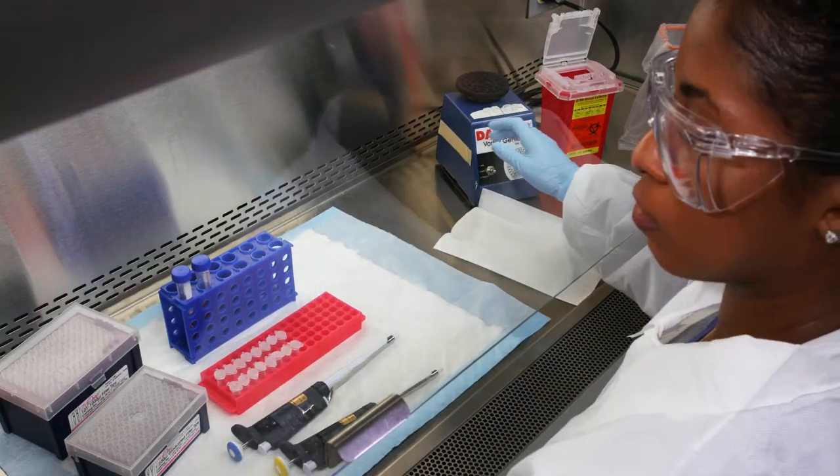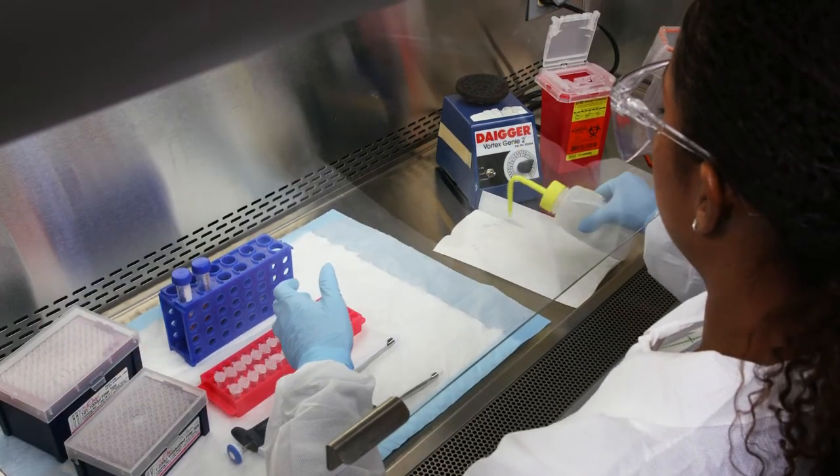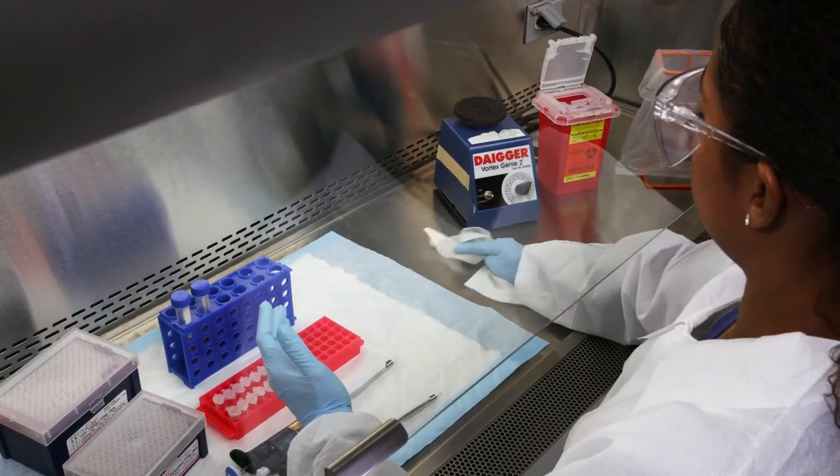If bleach was used, wipe the surface with ethanol or water to remove the residual bleach and prevent pitting of the stainless steel.